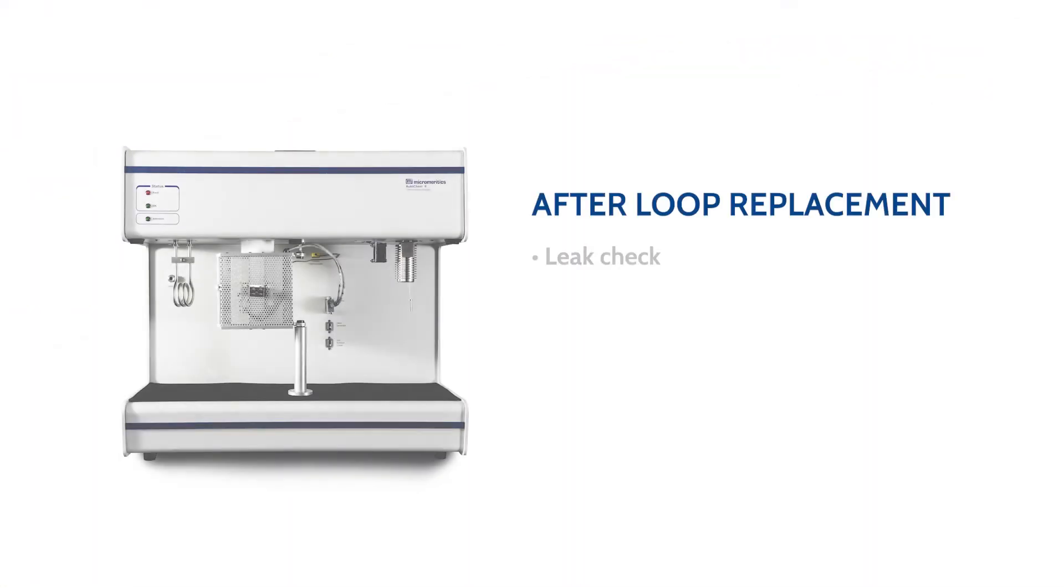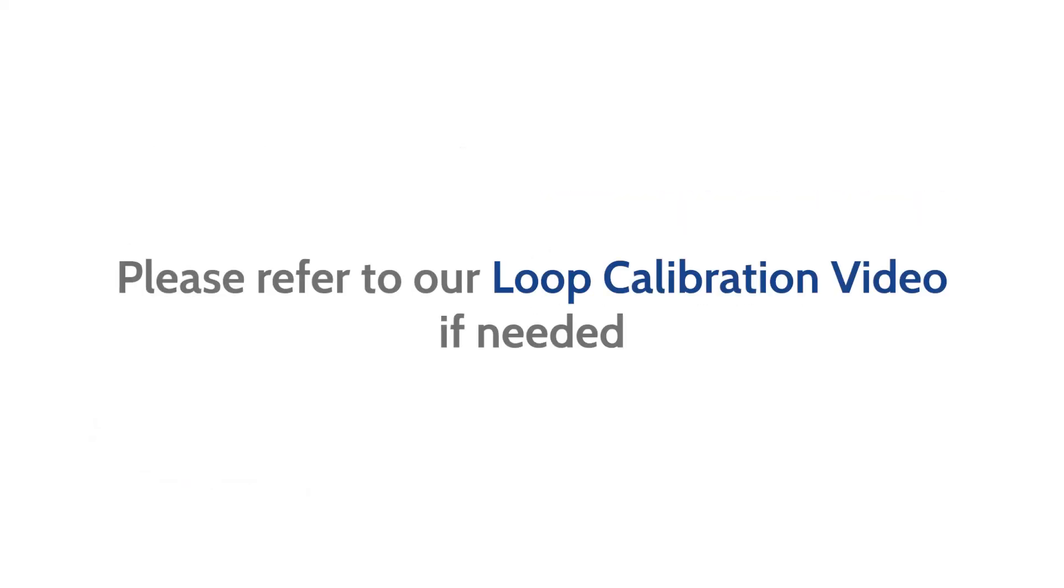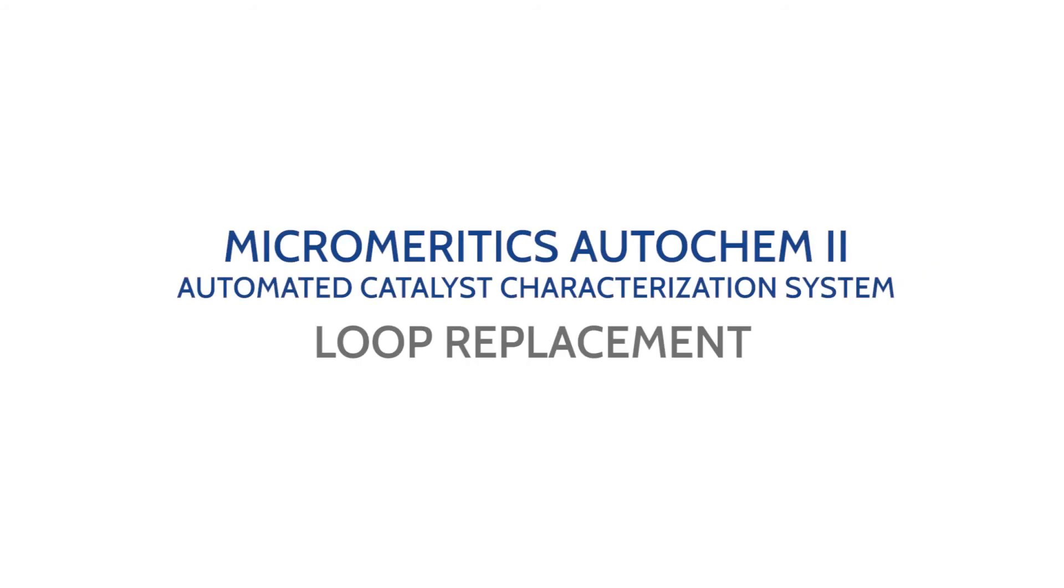A leak check and loop calibration should be performed after the loop is replaced. Please refer to our loop volume calibration video if needed. You have now replaced the injection loop on the Micromeretics AutoChem 2 Automated Catalyst Characterization System.